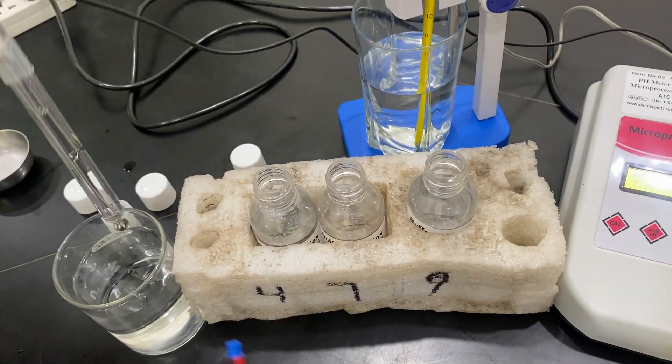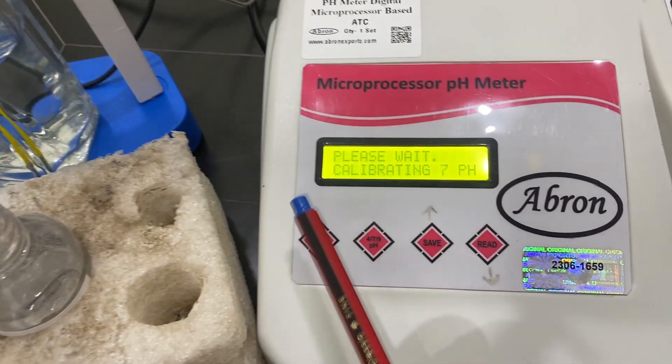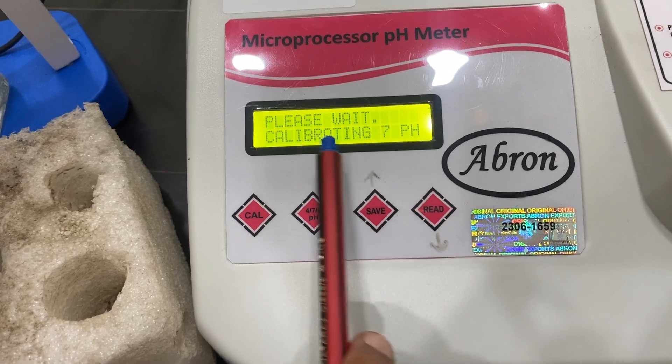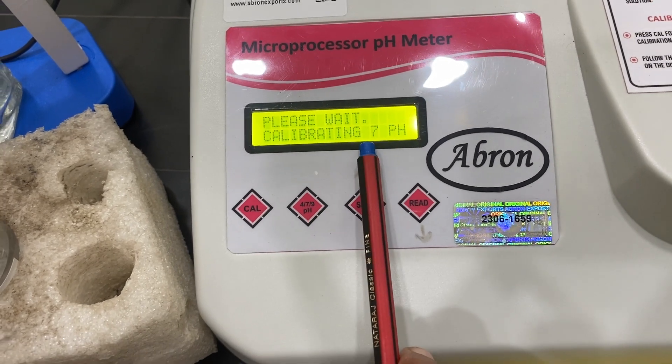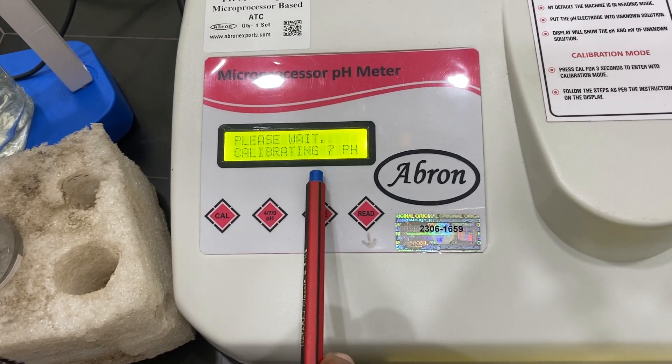Now I can wash the electrode and put it in pH 7. The display says press 7. I press it — calibrating in pH 7. It is going to take about one minute, then the calibration will be complete.